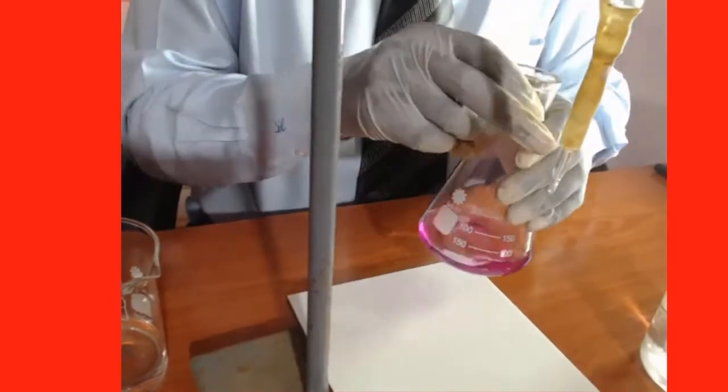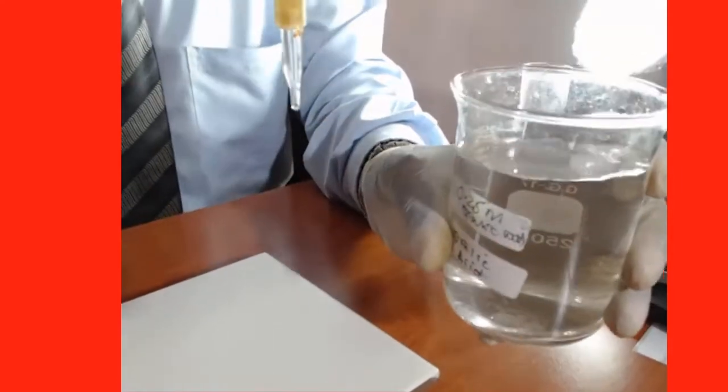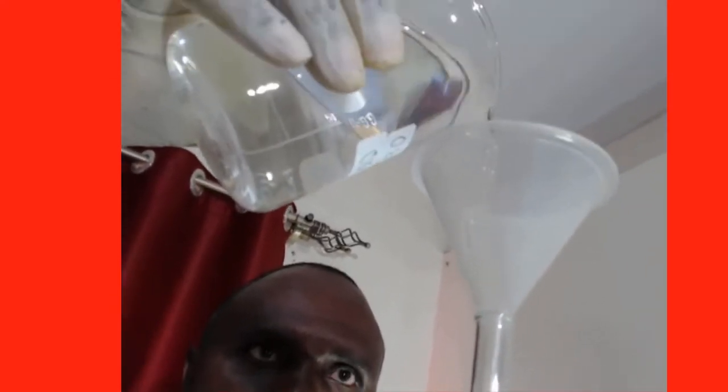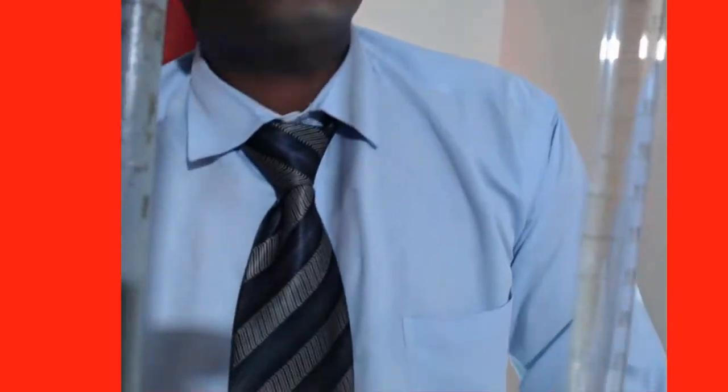Let us now put oxalic acid into the burette. Let us close the burette there. Let us adjust our solution to any point we want.